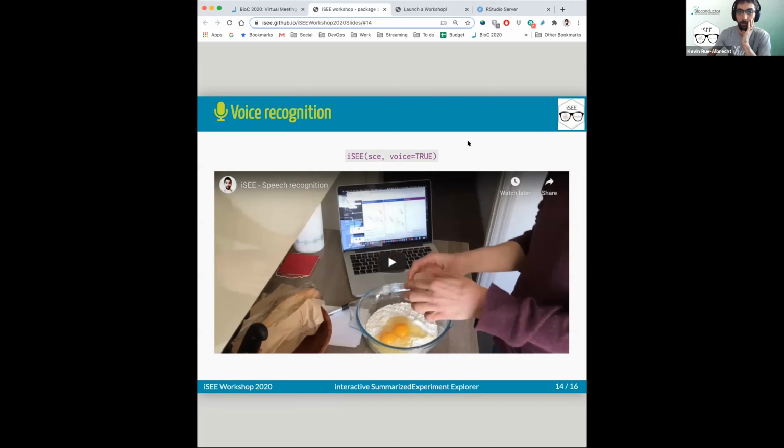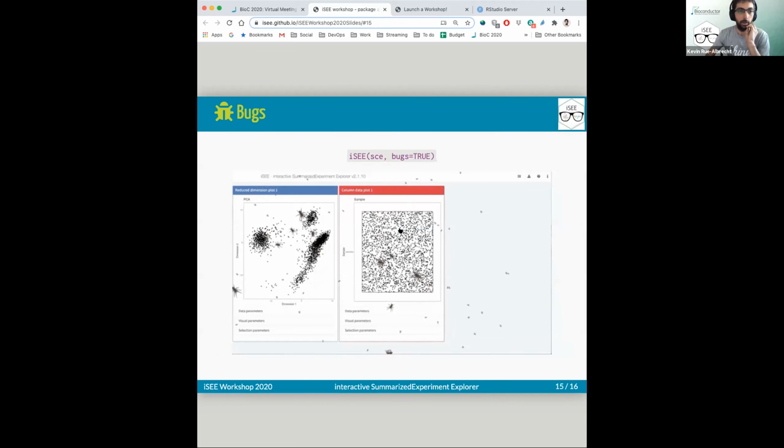There is a YouTube video that I'm not going to play now for the sake of time, but it's in the online presentation and it's pretty fun. So you can actually cook while you're doing your single-cell analysis. It's robust to egg crack. It really is amazing. And French accent. And French accent, yeah, exactly. And it's actually supporting the new panels as well. So you can call your panel whatever you want. New panel, it knows how to learn and recognize new panel names. It's just mental. And yeah, JavaScript, so that was just a warning I had at the start.